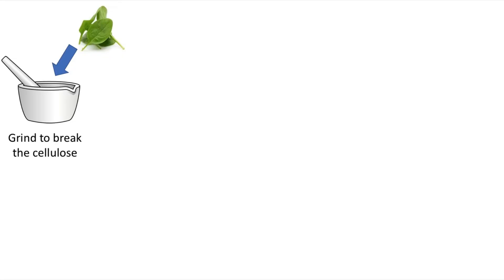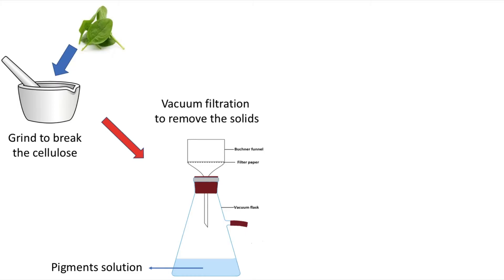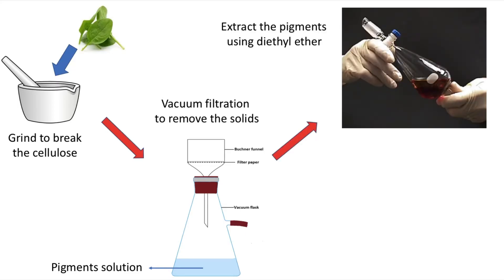The first part of the experiment is to isolate the pigments from the spinach leaves. The spinach leaves are ground using a mortar and pestle to release the pigments from the cellulose. It was ground with sand to help the process, and sodium sulfate anhydrous to absorb excess water from the leaves. The released pigments are dissolved in acetone, and then vacuum filtered to collect the filtrate and remove the solids.